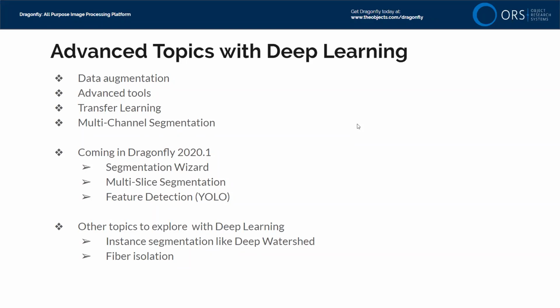Next question. Can you use deep learning to do object separation by showing manually well-separated objects in a network? Can this help when watershed type of separation doesn't work well? So it doesn't work as well as you would like. You could say, instead of giving it segmentation of just these are grains and this is air, can I give it these are segmented grains and this is air and expect it to succeed? It doesn't work so well.